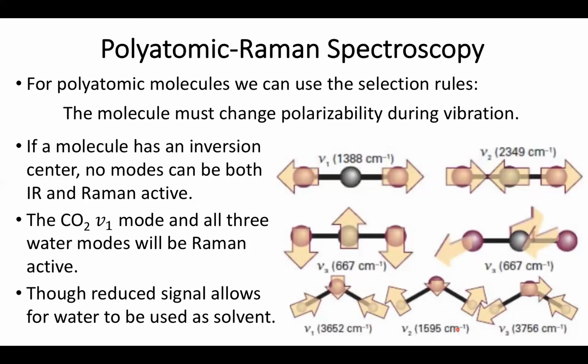It's a little bit more of an infrequent technique, but still has a lot of use. Unfortunately, due to the fact we are measuring scattering instead of absorption or emission, it tends to mean that Raman spectrophotometers are a little bit more expensive, thus the fact that it's used a little bit more rarely, while it still ends up providing a lot of very useful information.